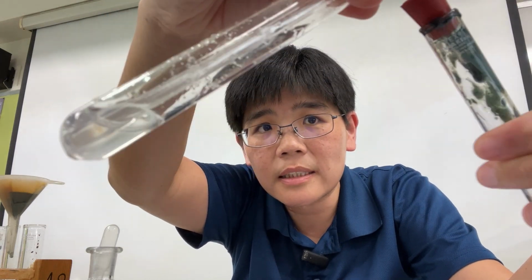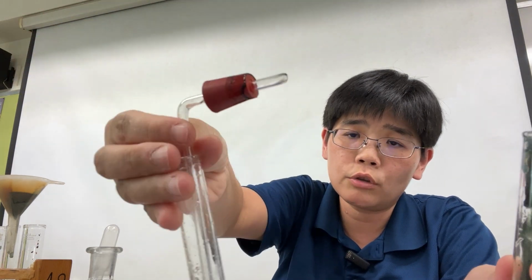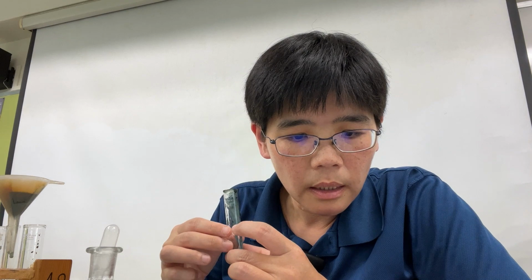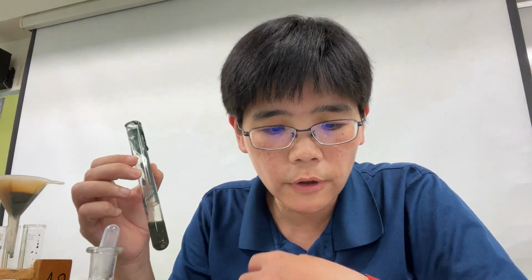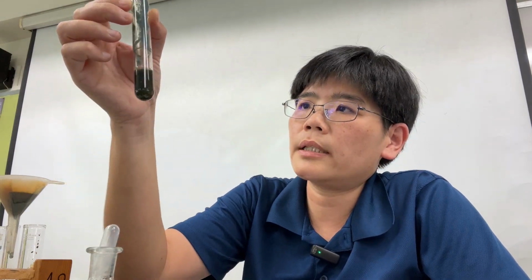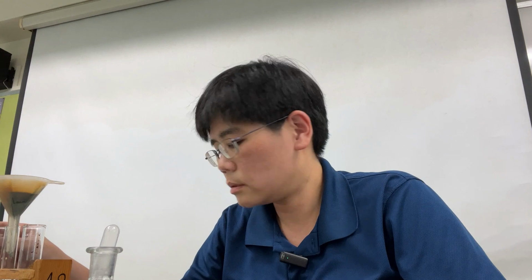Okay, so with this I disconnect. I leave the delivery tube still in the test tube of lime water, and then I need to observe the test tube for 1 minute, and then later on I will shake the test tube. Okay, so let it settle down. So part C answer will begin with effervescence. The gas forms a white precipitate in lime water.